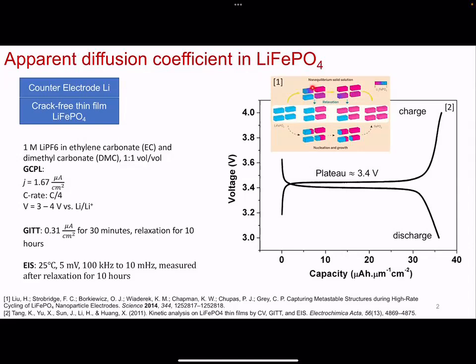What you'll notice is the single phase region will actually relax and then go through the 2-phase region again. So that does happen. So you can achieve a 1-phase by charging really fast, but when you're not doing that, typically this material goes through 2 phases.